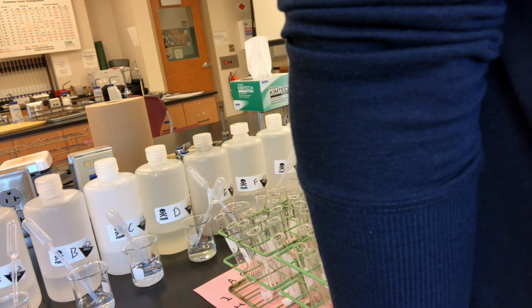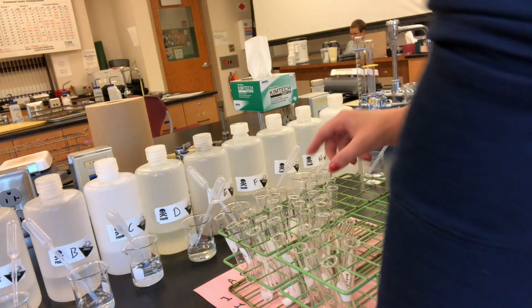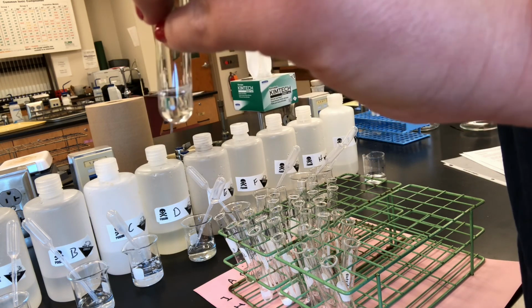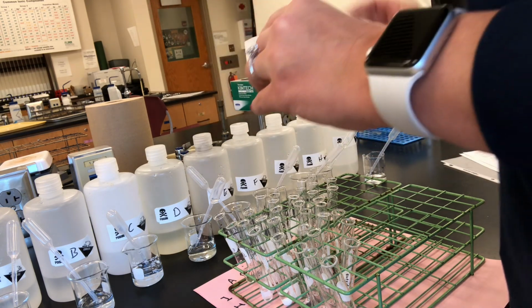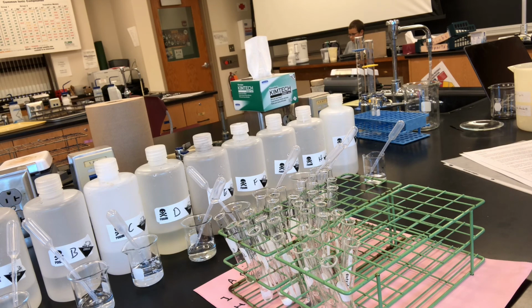All right, what do I got left? H and I. Those are the only ones left to mix together. So here's H. I'm going to go ahead and add I. No change. All right, that is all of my solutions. I have mixed everything with everything else.